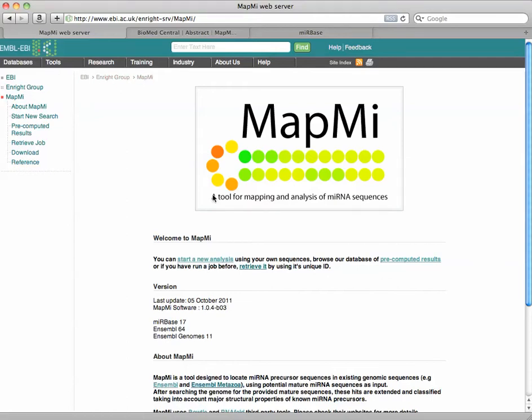MapMi is a tool for mapping and analysis of microRNA sequences. Today I'm just going to show you how to basically use it. It's relatively straightforward, but can give you lots of information about microRNAs.